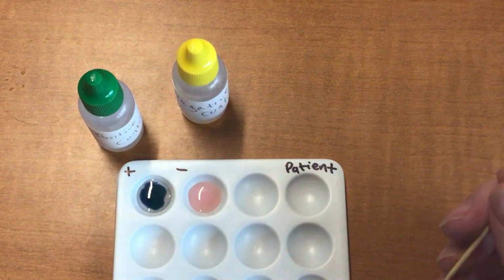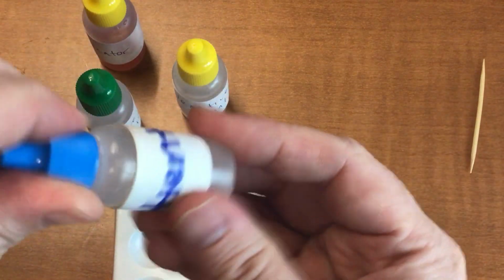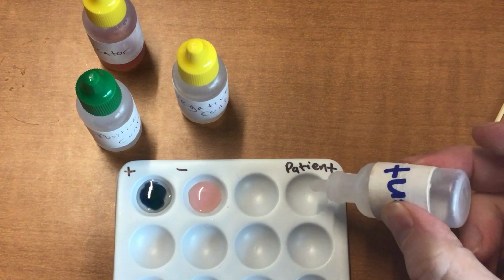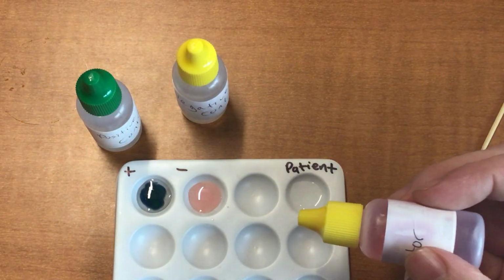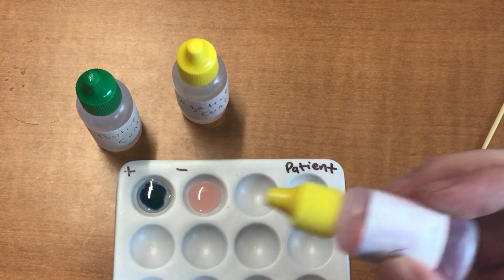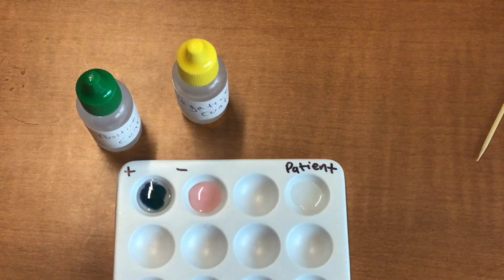And now what you're going to do is get your actual patient. So this is the patient from 1.4, the one that we want to test for. And we're going to pour this patient sample over here, next door, says patient, 3 or 4 drops. And now all we really have to do is pour that same chemical indicator into the patient and compare. Does our patient compare favorably to the salmonella? Or does our patient compare favorably to someone who does not have salmonella? So is our patient positive for the disease, or is our patient negative for the disease?